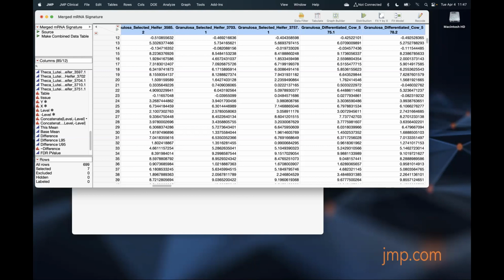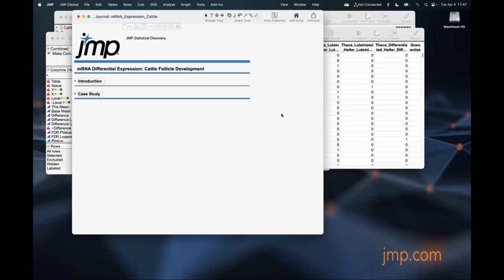One little question here real quick. Will we be able to check for population admixture? Not yet. But that's a great thing to put on our wish list, which I'll point to as well. If there's something you don't see, let us know. We have a wish list. We pay a lot of careful attention to what people do. And so that's good. So let me clean up here.